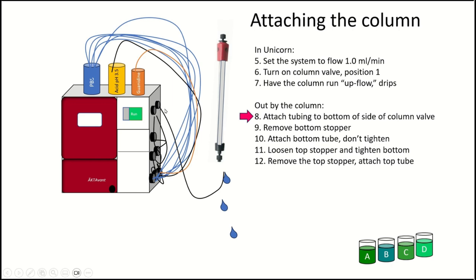Okay. Now we're going to attach a bit of tubing from the column valve to, we're going to just attach that there. And so now the drips are going to be coming up the bottom of the tube. And then we're going to remove the bottom stopper on the column still have buffer dripping out of the tube there. And then we're going to attach the bottom tube to the actual column, but we're not going to tighten it. What that's going to do is it's still going to allow flow to go through the tube, but it's still going to be dripping at the bottom.